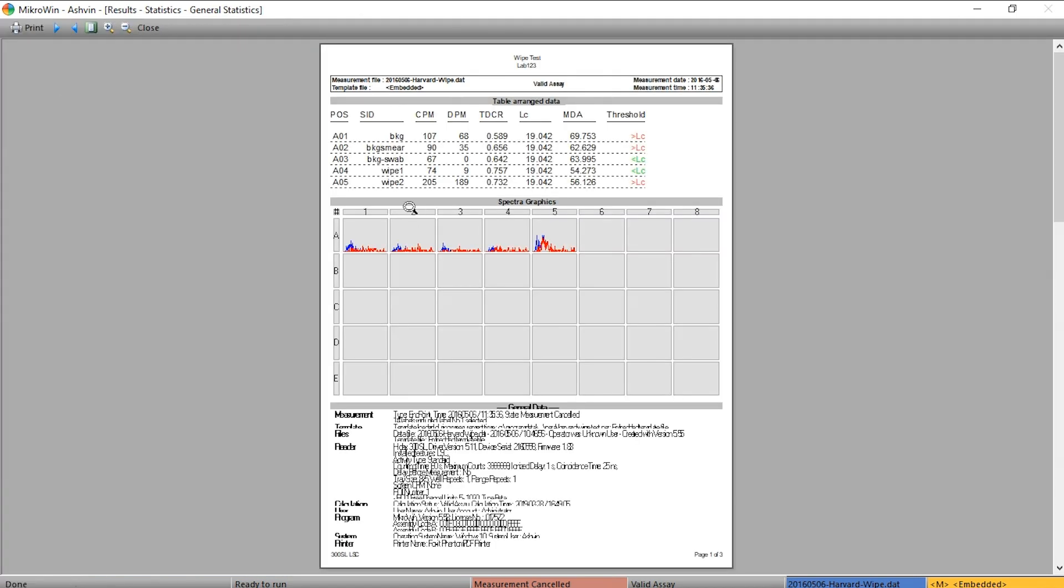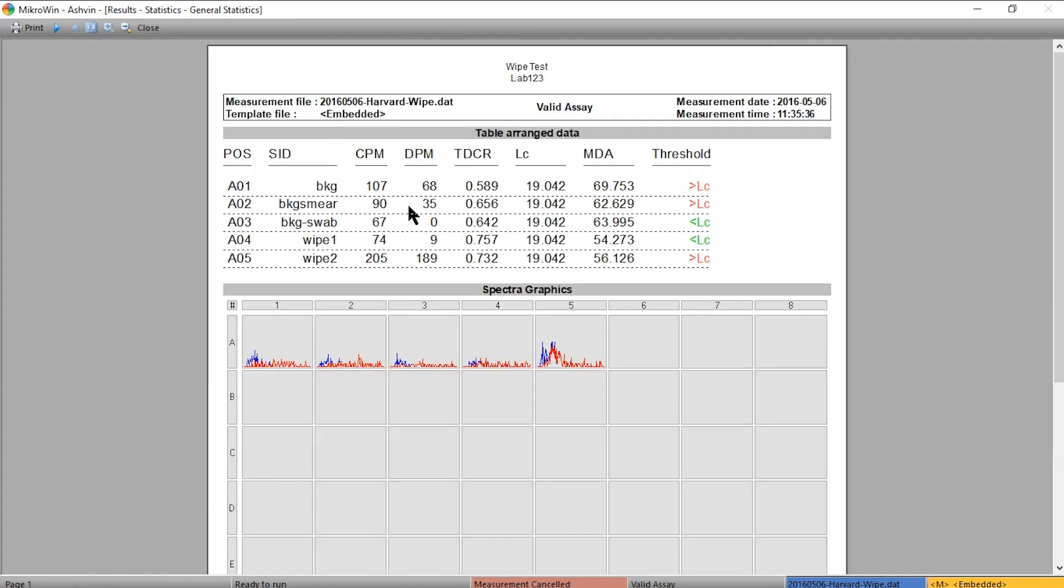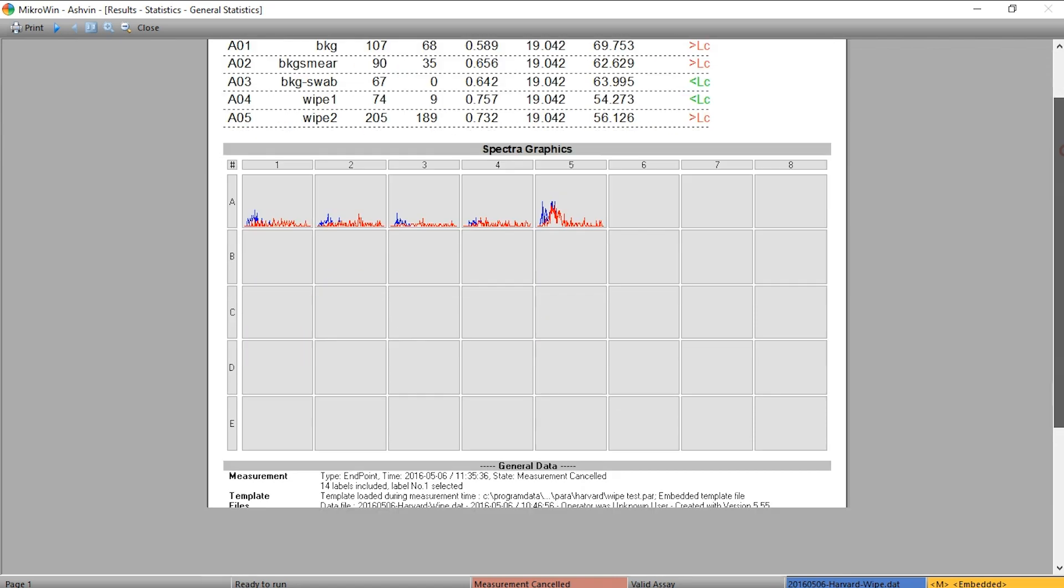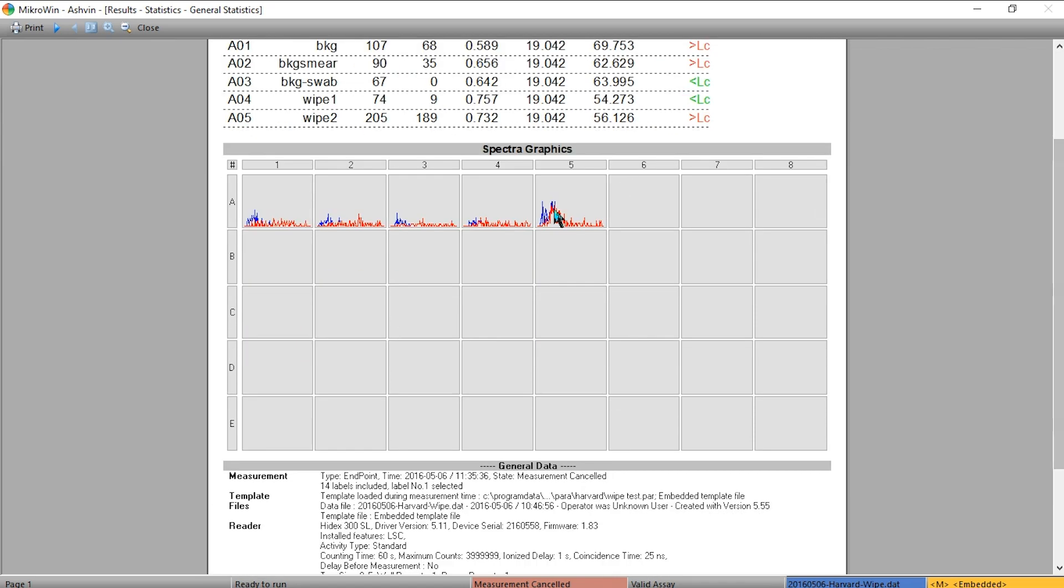Then you can zoom in and see the position of the samples A1 and A2, sample name, cpms, dpms, tdcr, efficiency, lower limited detection, MDA, and custom threshold. Here we have the spectral graphics as well as the metadata for each sample for this run.